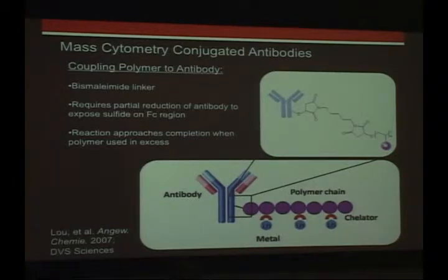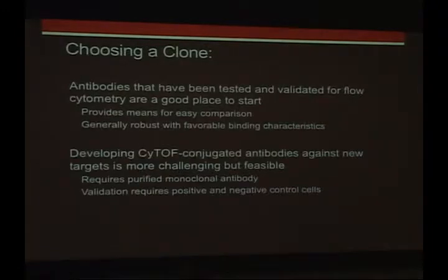And the reaction really does approach completion. So we can label antibodies fairly standardly. Repeating the same protocol on the same clone of antibody generally gives very similar results, which is great for reproducibility.